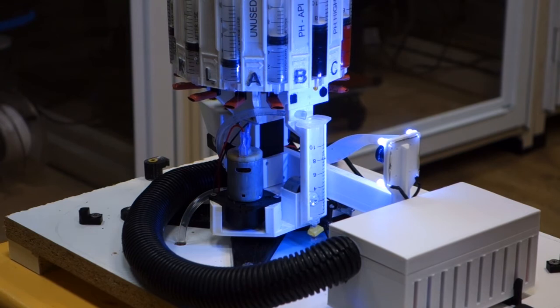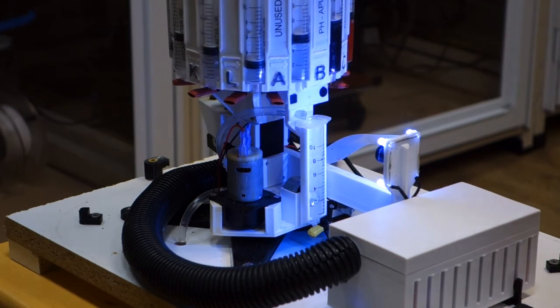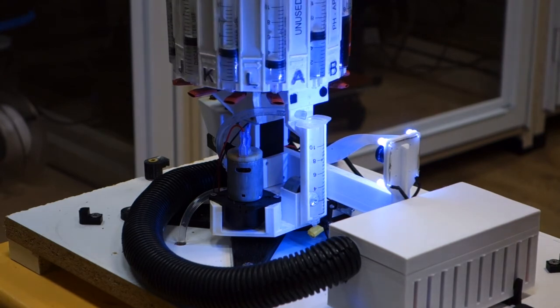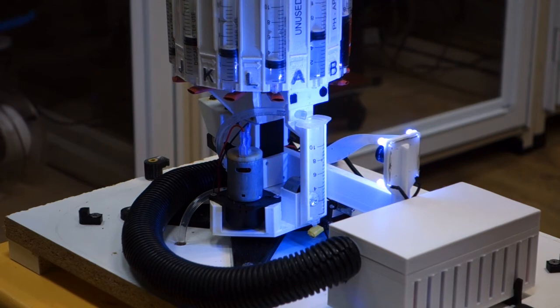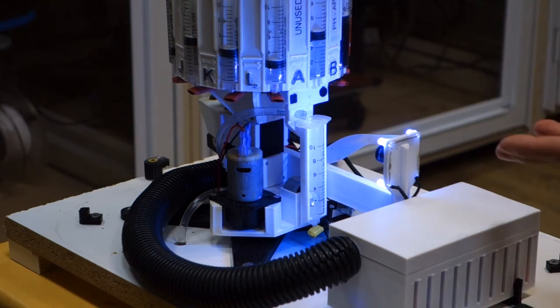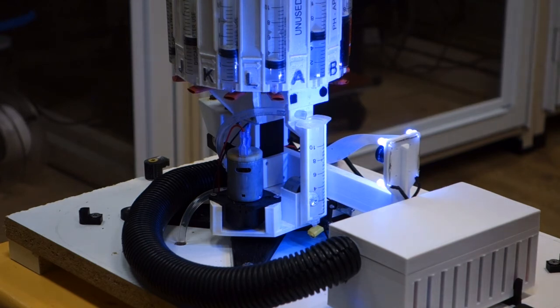The last thing you're going to see it do is retracting the plunger and it rotates back into place. It's going to lift these little stoppers. It's going to make sure that they're positioned correctly. But these stoppers are used to stopper the end of the syringes so that no air gets in there and dries out the solution. Okay, so it looks like it's completed this process and it's parked the unit. So this is the autotester.